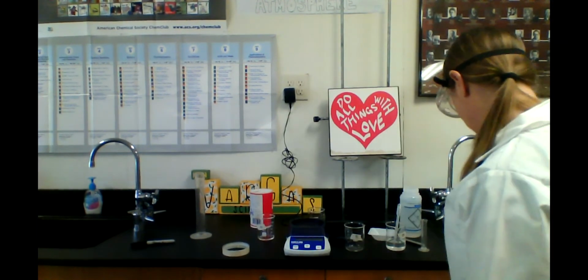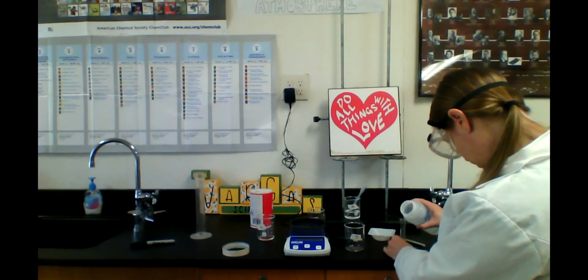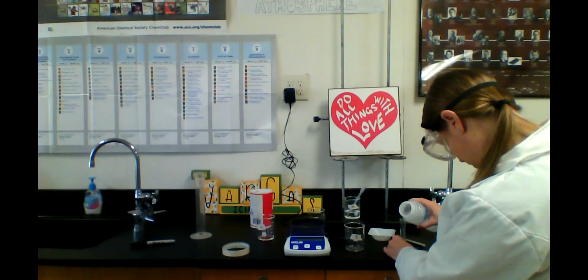So in my 20%, I only need 4 milliliters of H2O. Okay, so let's move this out of the way so it doesn't get knocked over. So I need 4 milliliters of distilled water. I went over a little bit.